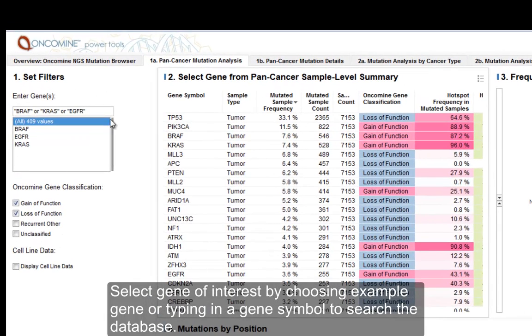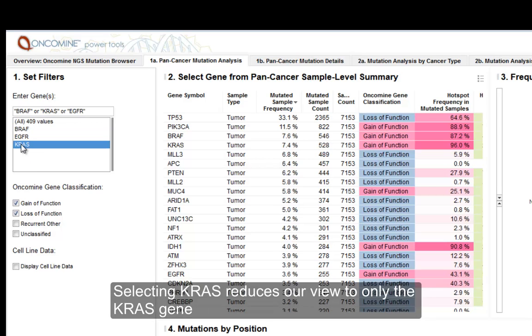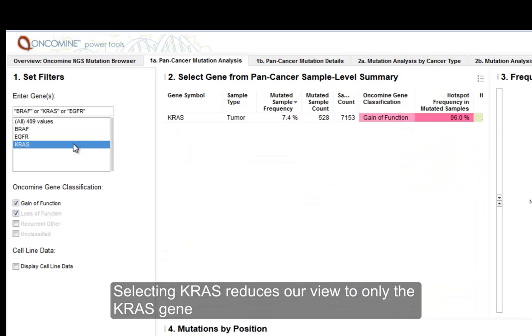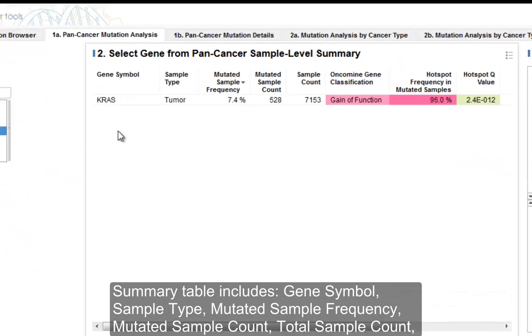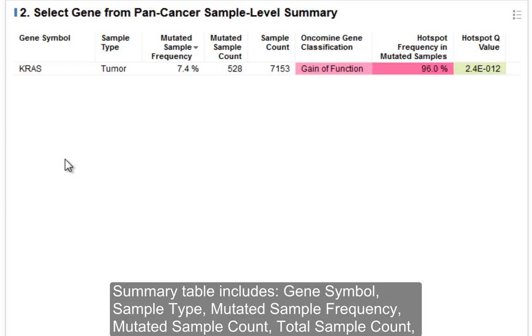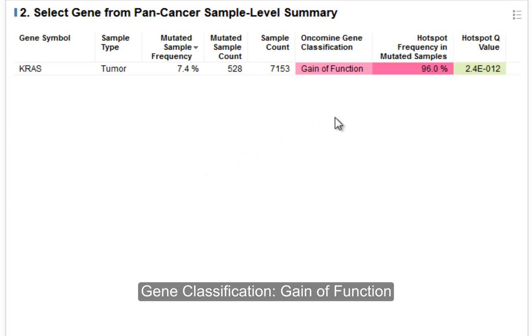First, we'll select our gene of interest by either selecting one of the examples, or you could type in your gene of interest to search through the full list of genes in the database. I'm going to select KRAS, and that reduces our view to only the KRAS gene. You can see that this table includes gene symbol, sample type, mutated sample frequency, the mutated sample count versus total sample count, and the gene classification of gain-of-function.